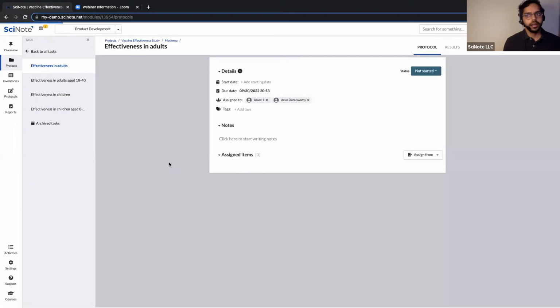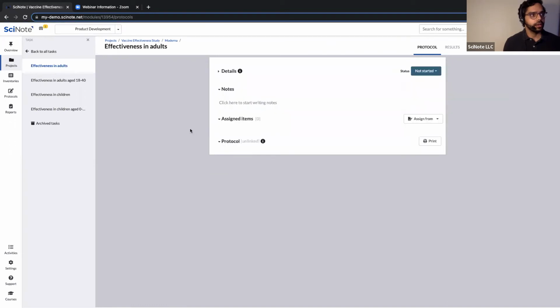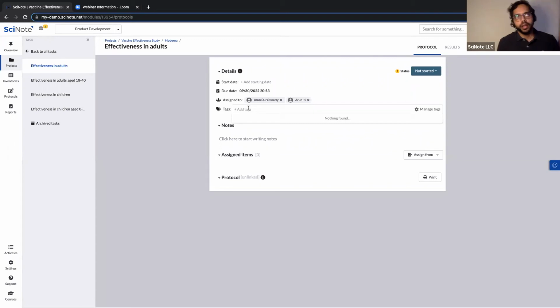All right, so now that we've created the protocol, let's go ahead. Oh, I wanted to discuss the tags as well. So the tags. So tags work the same way as hashtags do on the internet.